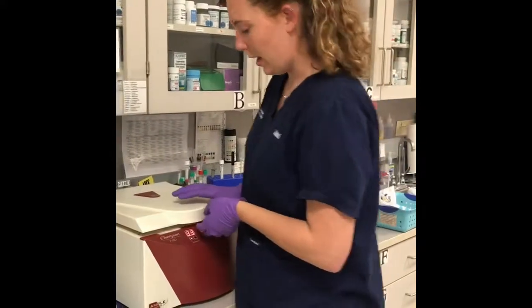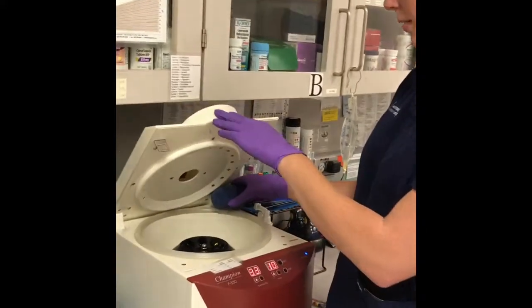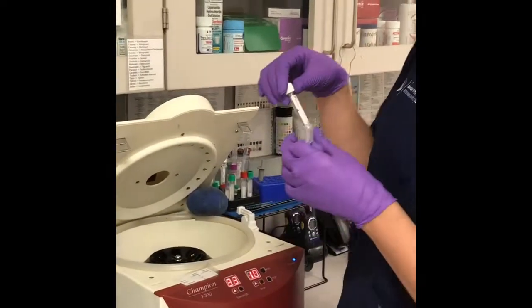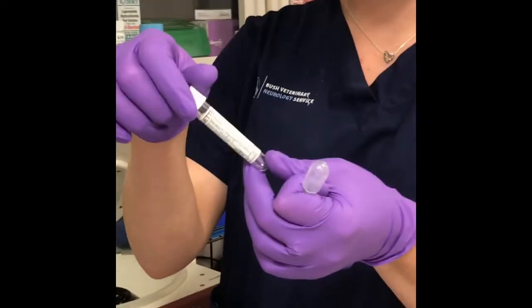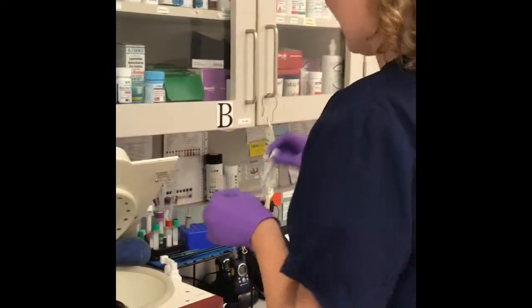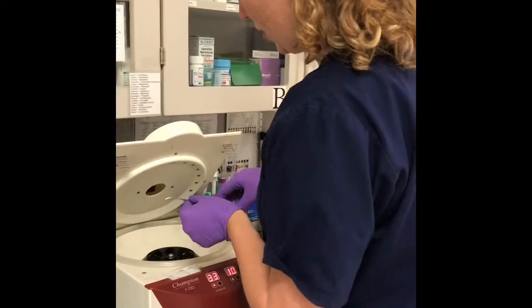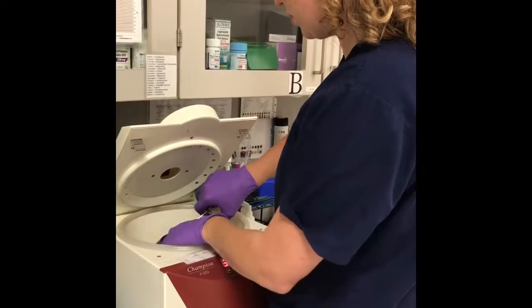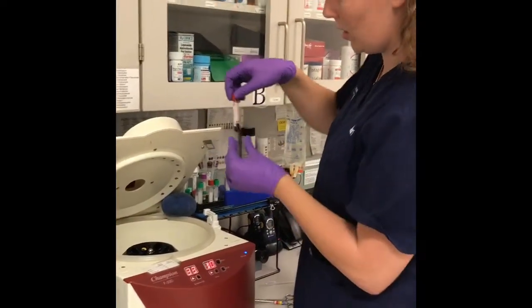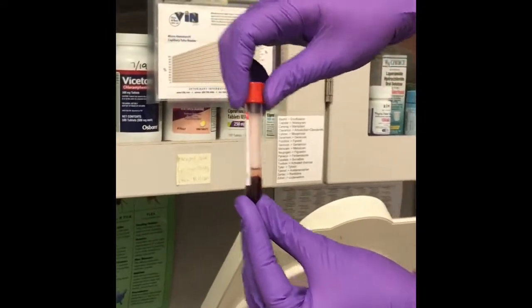All right, so our blood tubes have completely finished spinning in our centrifuge. Just going to go ahead and harvest our serum using a disposable pipette, and then I've got a plain tube with no additive, and I've gone ahead and labeled that with the patient's name, ID number, and date. Just going to go ahead and remove our samples from the centrifuge. So there's our clot activator. It's got some very mild hemolysis, but overall a clean sample.